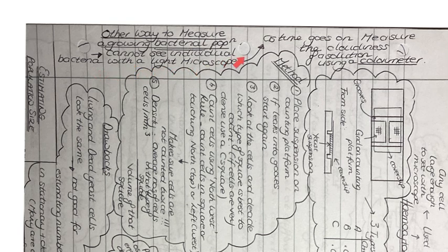As time goes on, as the bacterial population grows, the flask will become cloudier and cloudier. So you can actually estimate the size of the bacterial population by measuring the cloudiness of a solution. The cloudier it is, the greater the size of the bacterial population. And you can measure the cloudiness of the solution by using a colorimeter.